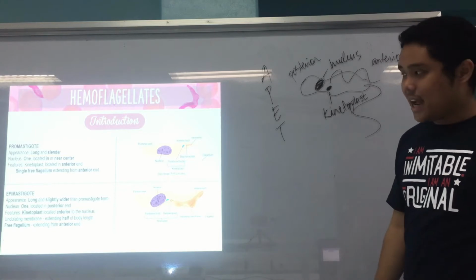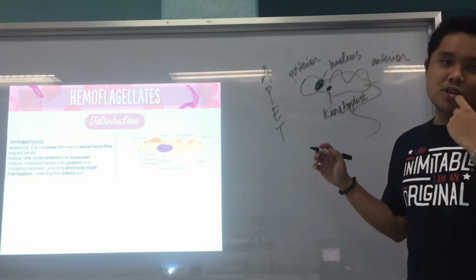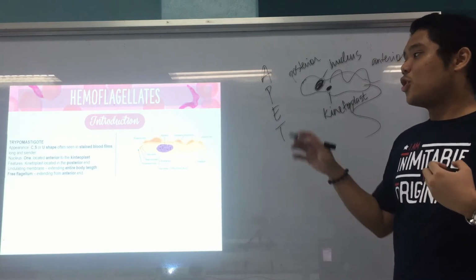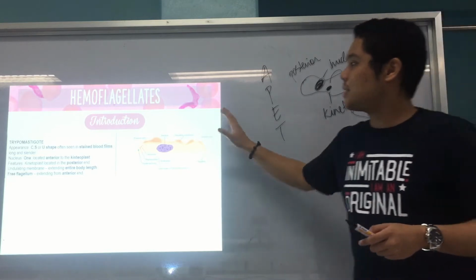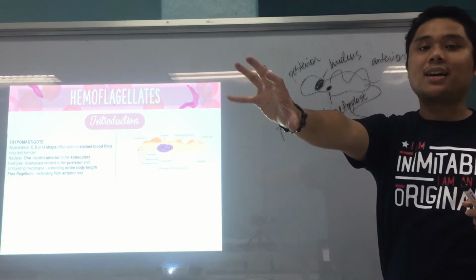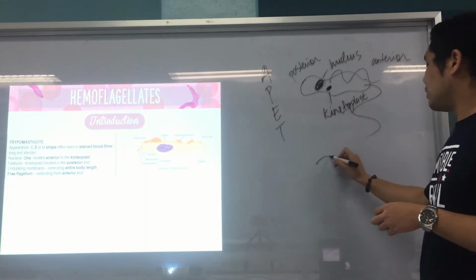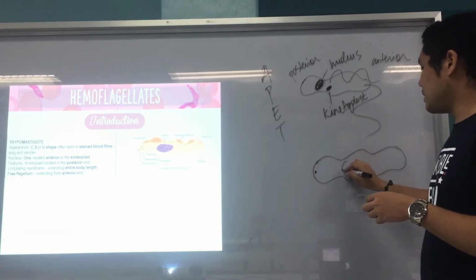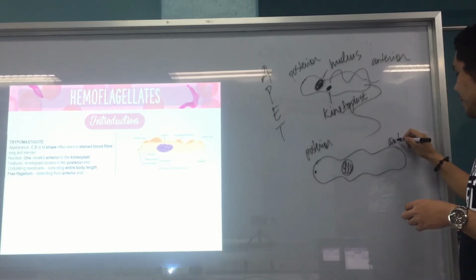And next, of course, for trypomastigote, as you can see, the shape can be C, S, or U, similar to the letter C, S, or U. It's the stage often seen in your blood films. Your nucleus now is anterior to the kinetoplast. The kinetoplast is much at the back now of your nucleus. So this is now your trypomastigote. This is your kinetoplast, and this is the nucleus. This is the posterior end still, and this is the anterior end.